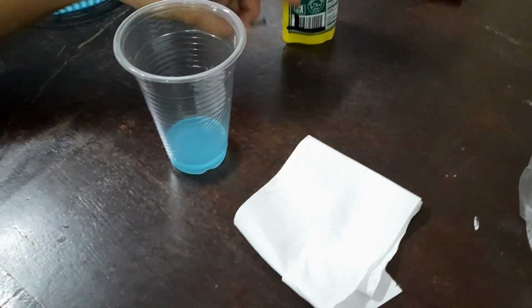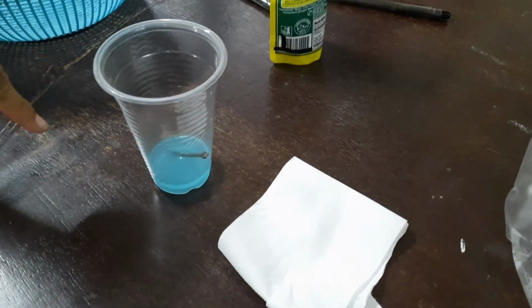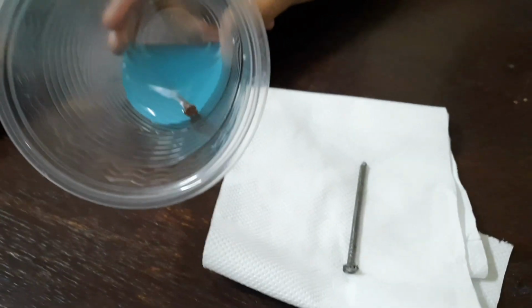For setup A, chemical reaction of iron nail with copper sulfate solution in water. Iron displaces copper ions from an aqueous solution of copper sulfate. It is a single displacement reaction of one metal by another metal.